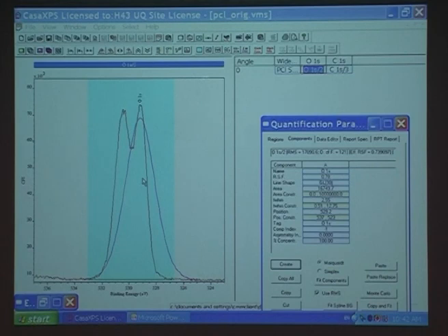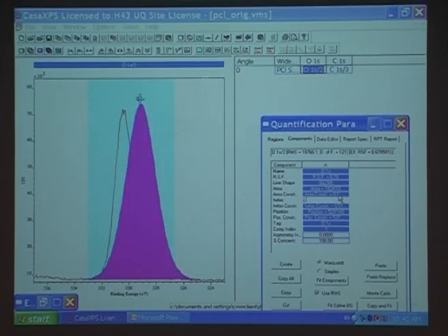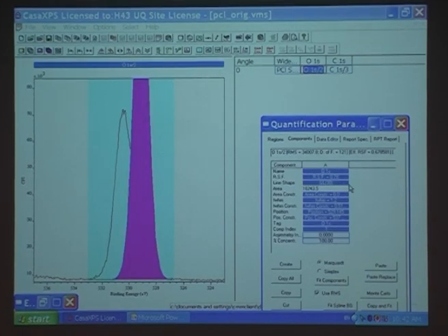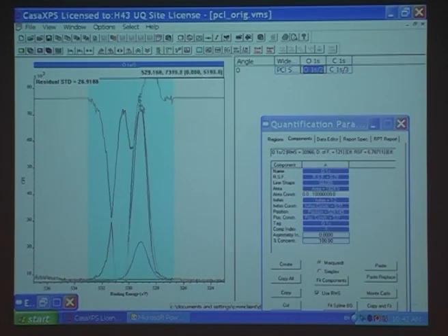Now, I'm going to try and get a good fit. See, this is horrible. Look at this. This should be matching here, and it's gone to a width of 2.5. I'm coming in here, and I'm going to try 1.2. Enter. Again, it's gone very high in the area. So I come into here, go there and reduce it a little bit so I can grab the top of the peak and bring it up here and say, how are we going?